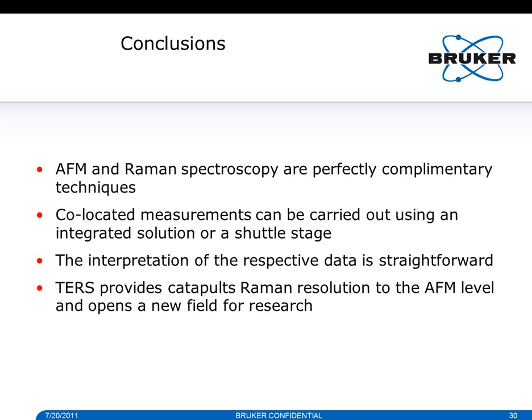TERS, of course, catapults the Raman resolution to the AFM level, and opens a new field for research. There's plenty of stuff available, and it's quite an exciting field to work in.